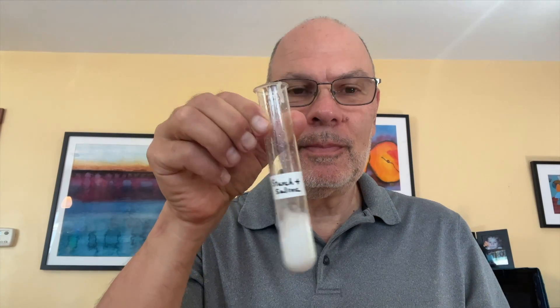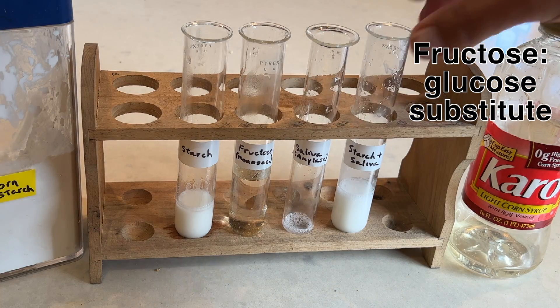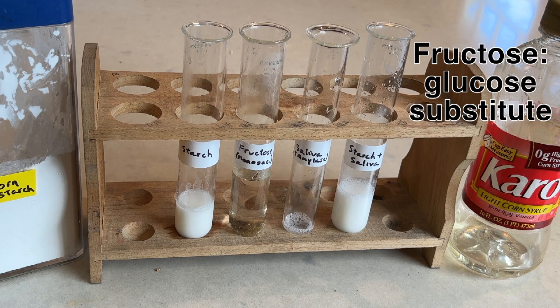I'm going to add my saliva to two test tubes. This one will be our control. It has nothing but saliva. This test tube has starch solution, and I'm going to add some saliva to that test tube too. Now I'm going to set the test tube with starch and saliva aside to give amylase a little bit of time to do its work.